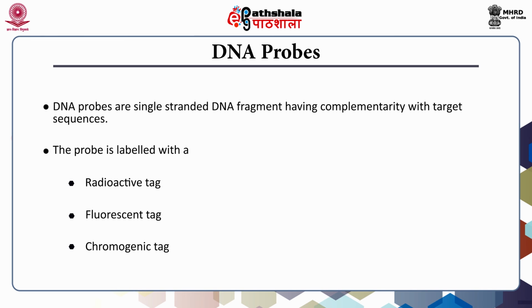In many cases, RNA can be designed in place of DNA as a probe for ensuring the specificity of probe to the sample DNA sequence during hybridization. Salmon sperm DNA is used for blocking the surface of the membrane. After hybridization is over, the excess of the probe is washed off from the membrane by using saline sodium citrate buffer.